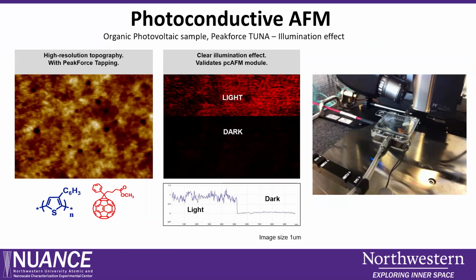Since we now have this setup on the Raman system, mostly whoever wants to use it can get trained on the Raman, because we have 4 lasers on the Raman system. You can control the laser powers. And because the Raman system is integrated with AFM, you can measure these photoconducting properties. You can still do TERS imaging. You can measure the Kelvin probe or conducting AFM. So everything can be done together, and you have the ability to control the laser power. This type of technique is very useful, especially for solar cells or perovskite materials. And we have these facilities in our setup.